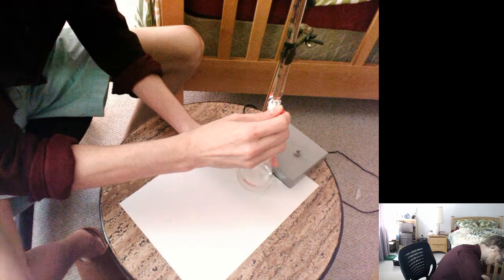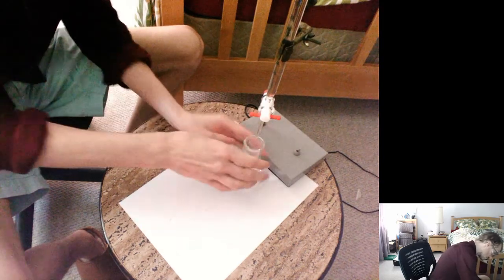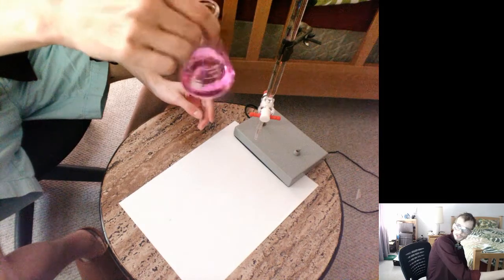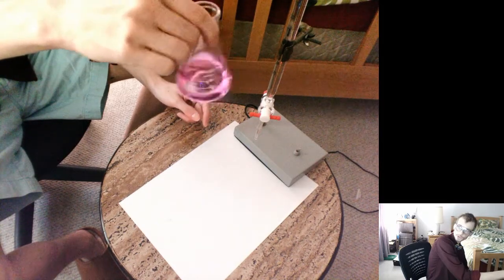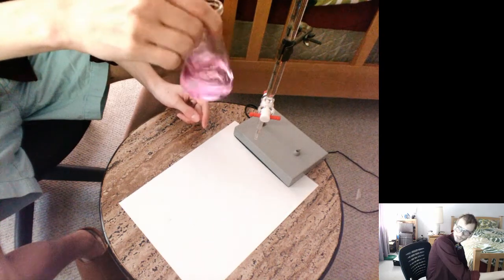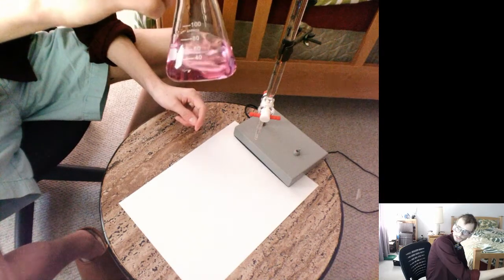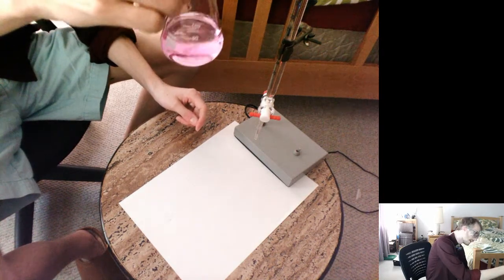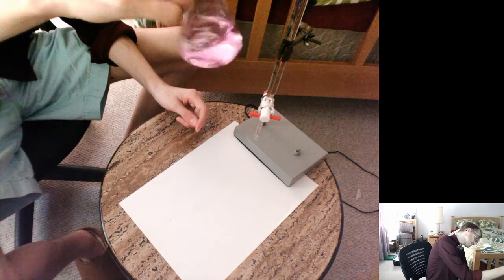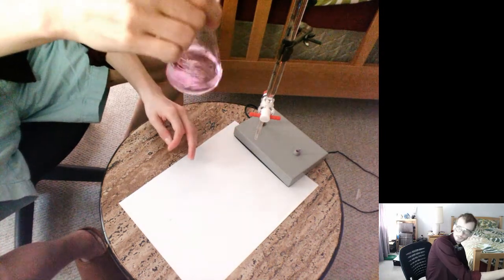So I'm going to add just 1 more drop if possible. As you can see, it's a bit of a slow process in real life. And that's 1 drop. Bam, that's all I want to get in there. And I'm going to stir it up. You can see it turns a dark pink color just with 1 drop. And as I stir it, it gets a little bit lighter. And so I've got a nice light pink color there. And it's possible that this will clear up in another few seconds, and I would add another drop, or I could take the volume measurement that I have now. It's a bit of an art to it.